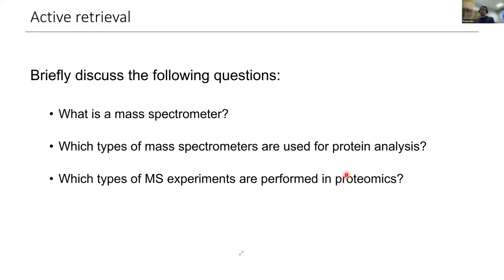Okay, cool. No, you named exactly those two that are, I guess, most popular in the proteomics field. So it's the Orbitrap mass analyzer that I think revolutionized the field since it was launched, well, now more than 10 years ago. And then QTOFs have always been around and maybe are now seeing a bit of a re-emergence. So cool, very nice.